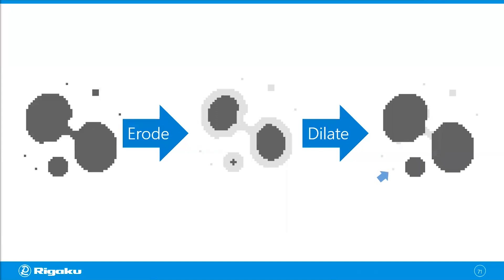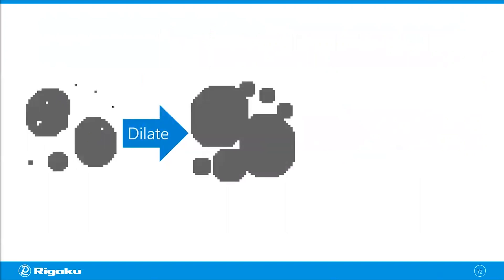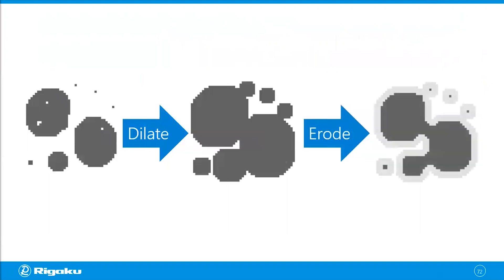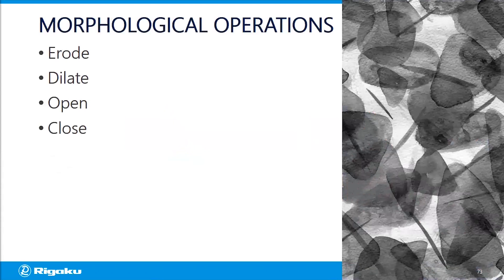The combination of erode then dilate is called an open operation — it separates objects and cleans up dust-like pieces. Conversely, if objects should be connected but are separated, and there are holes that shouldn't be there, you can dilate first to connect them and fill the holes, then erode back to maintain the size. This combination of dilate then erode is called a close operation — it connects objects and cleans up holes.